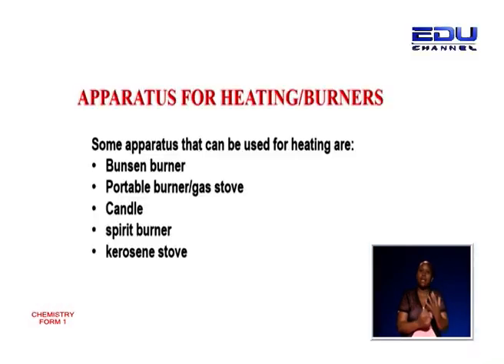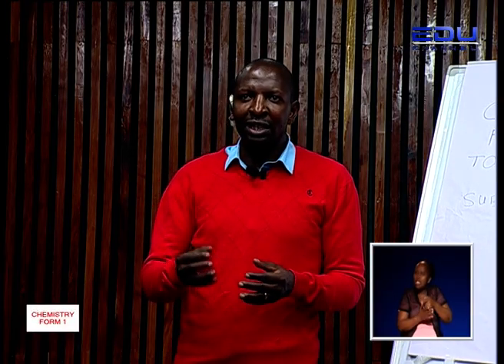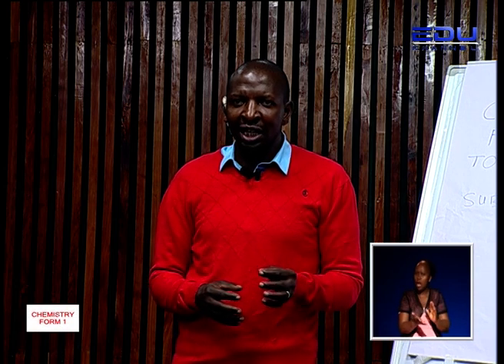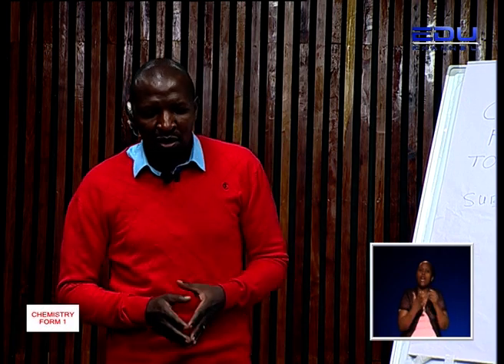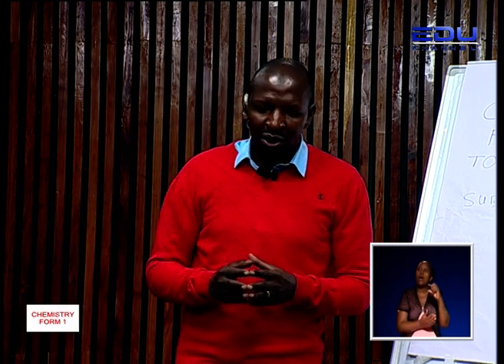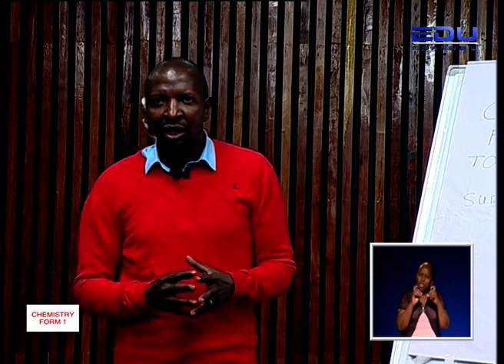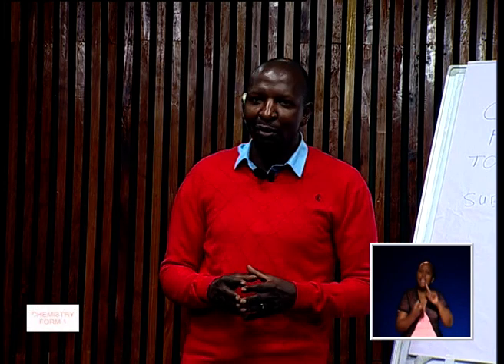We have candles, they can also be used. We have the spirit burners, and we have the kerosene stoves. But mostly in our laboratory experiments, we are going to be using either the standard Bunsen burner or the portable burner, or rather gas stove. So let's look at our apparatus of interest today, which is the standard Bunsen burner.